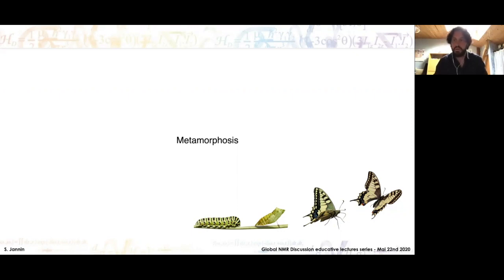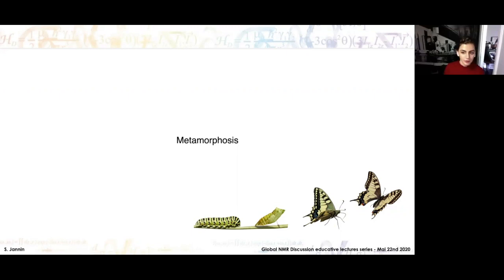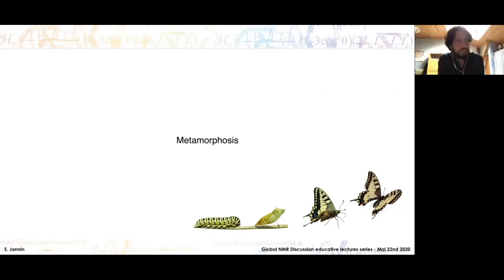And the next question is: in the case of pyruvate injection, how do you avoid injecting your polarization agent together with pyruvate, which will be in the sample even at low dissolved concentration? So for trityl, one way to do that is to change the pH and make a precipitation of the radical, filter the radical, and then we adjust the pH.